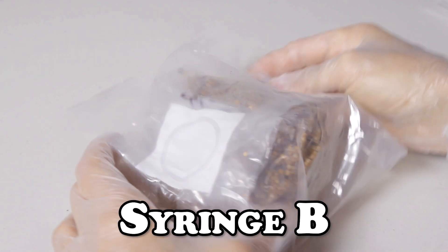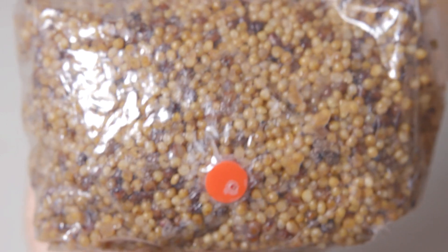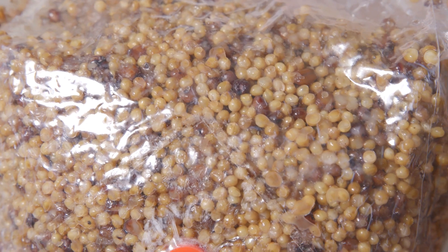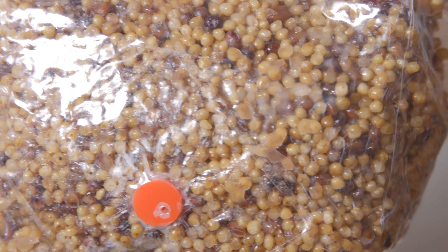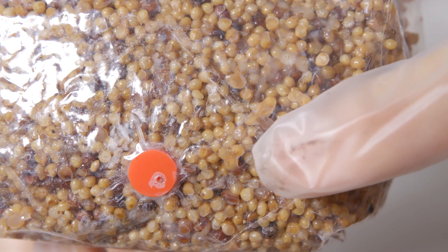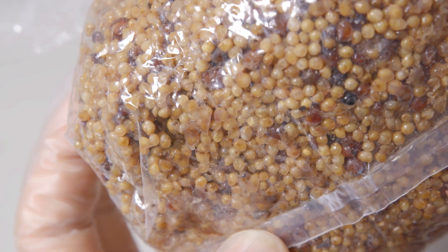Here's bag B and we are not looking too good. The bacterial activity has advanced rapidly. As the bacteria is consuming the grain, it's metabolizing it down into this soggy liquid mess and the smell is very distinguishable - somewhere in between fermentation and nightmares.